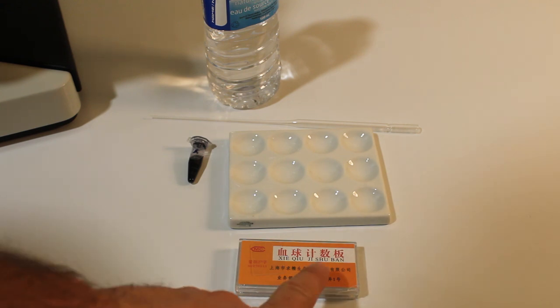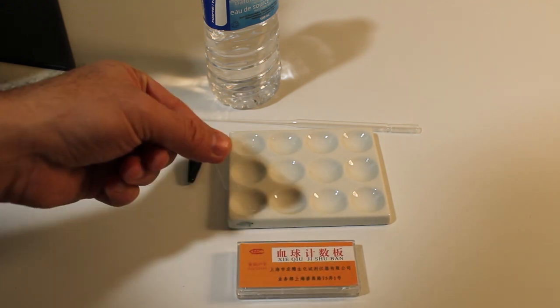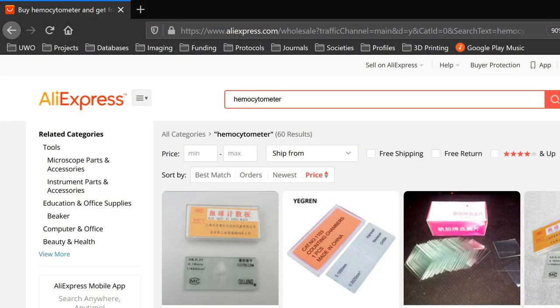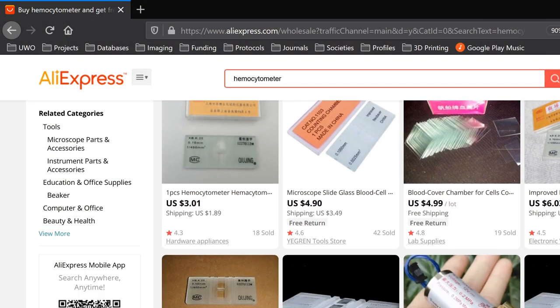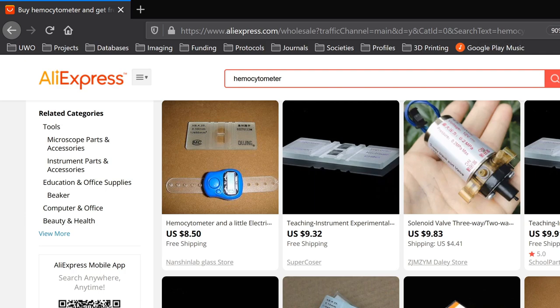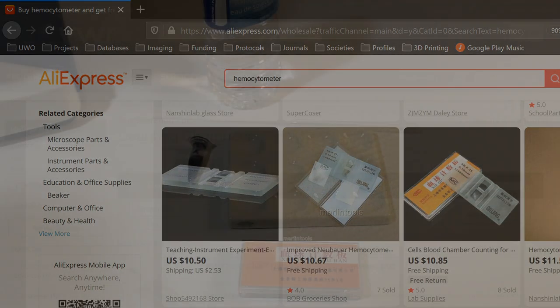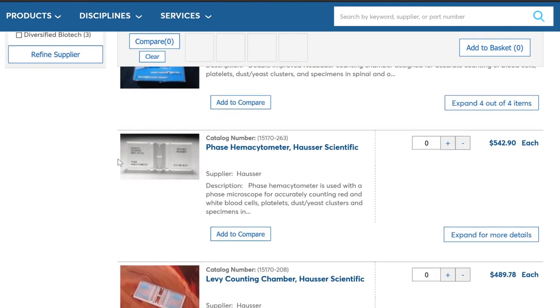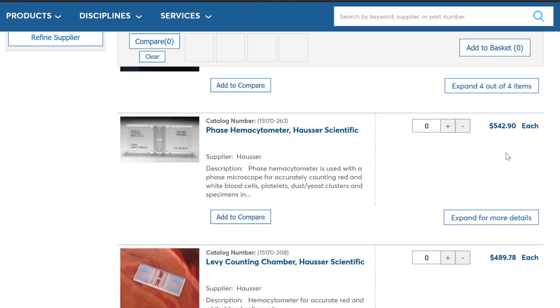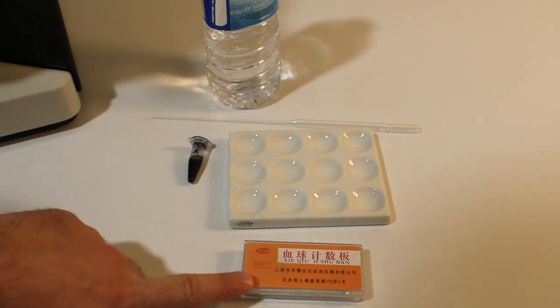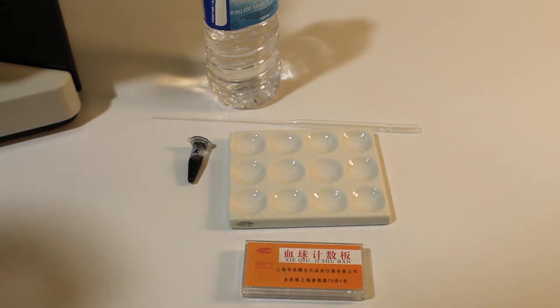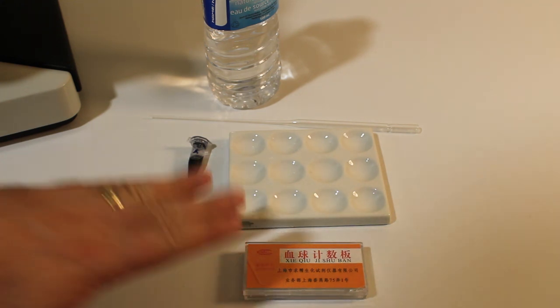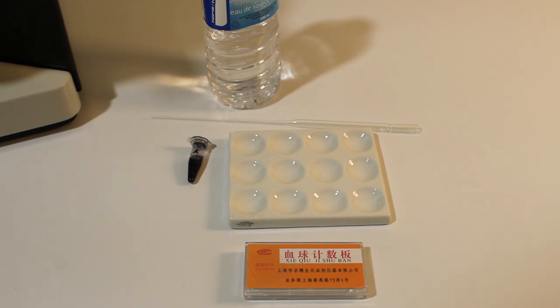For cell counting you're going to need a hemocytometer and a coverslip. Now you can buy cheap hemocytometers like this one as well as cheap coverslips for just a few dollars off sites like AliExpress. I have compared these to the clinical grade instruments that I have at work which cost around $400, and the counts that I get off of these inexpensive hemocytometers are within 3% of those more specialized clinical units. So for brewery use these really cheap Chinese made hemocytometers are more than sufficient.